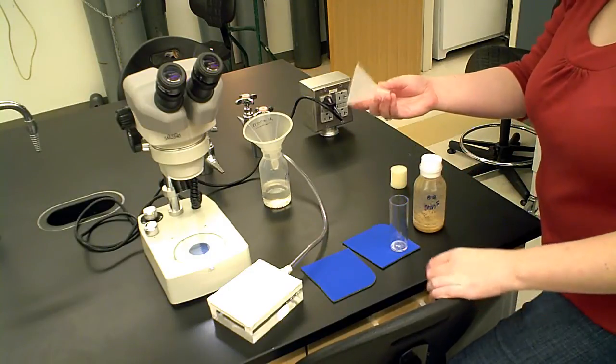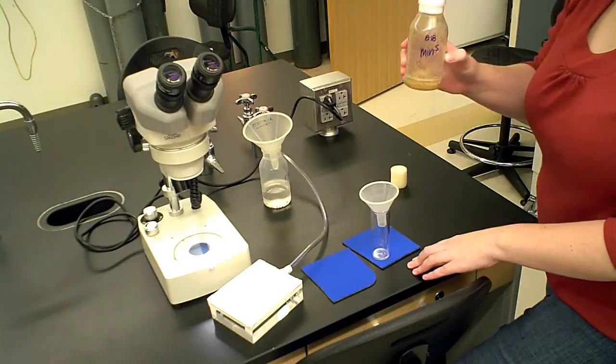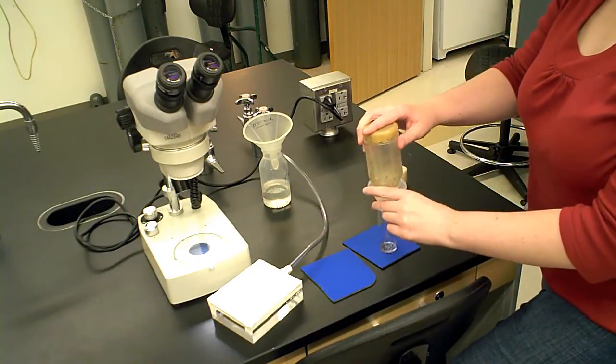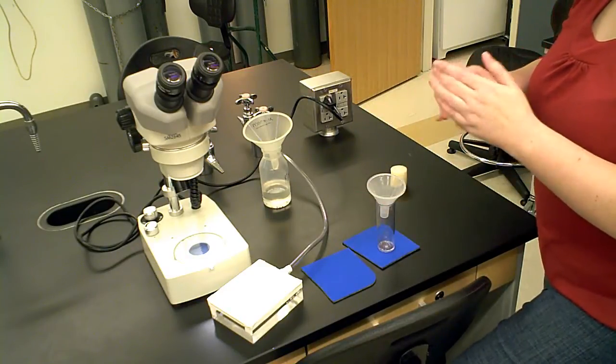You're going to put the funnel into the holding vial. You're going to very gently tap the bottle so that the flies fall down and then invert it onto the funnel and gently tap the flies into the holding vial.